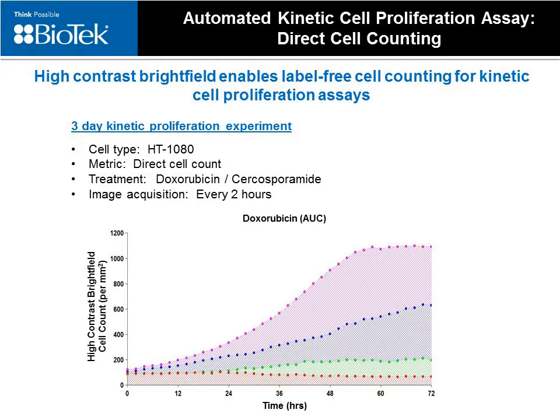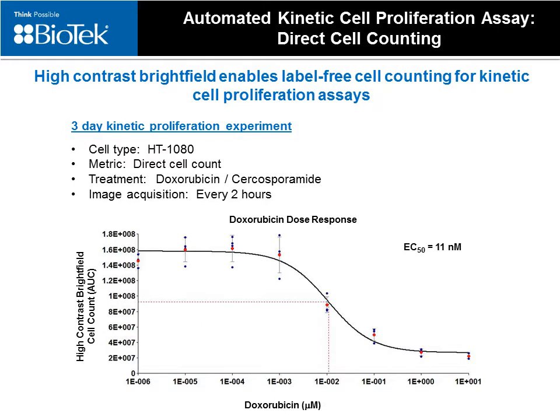As before, we can use the area under the curve for each cell count to quantitatively compare the proliferation rates across conditions using cell counts. And then from these generate very informative dose-response curves that really provide increased sensitivity with a more direct approach to the evaluation.